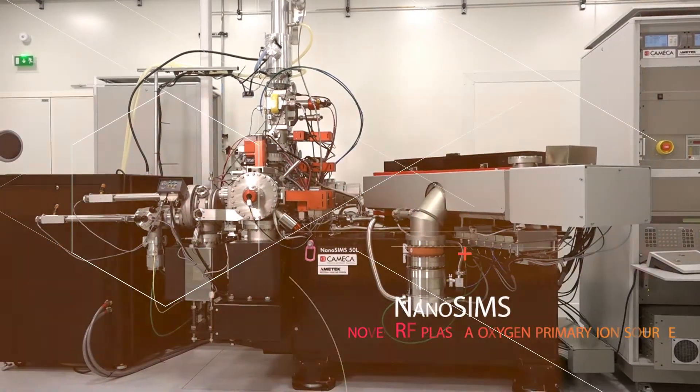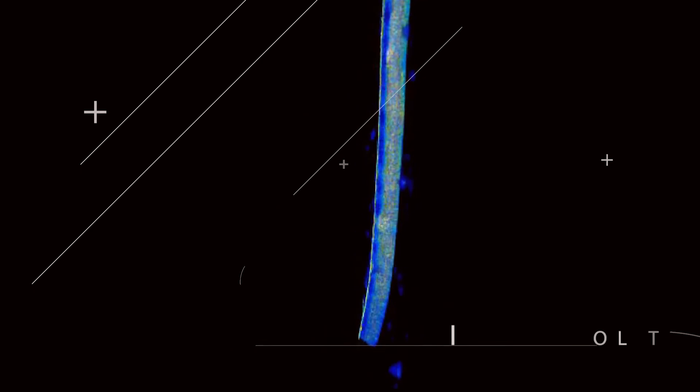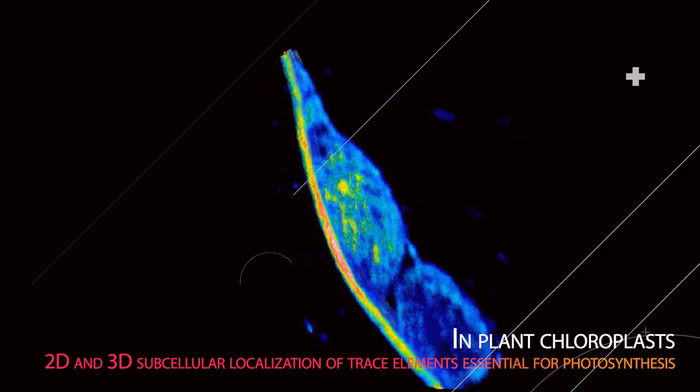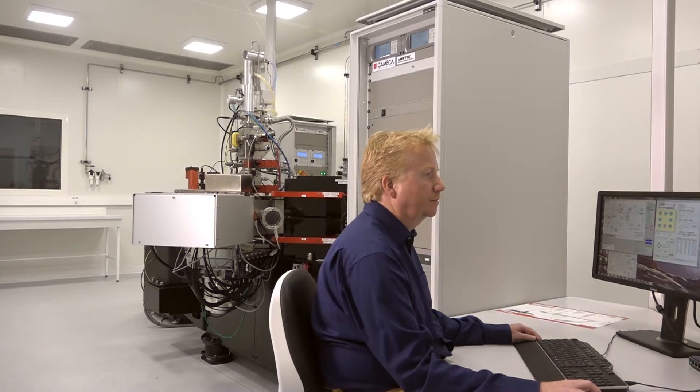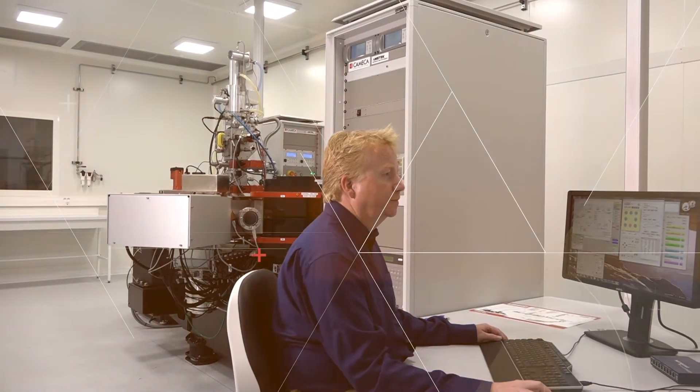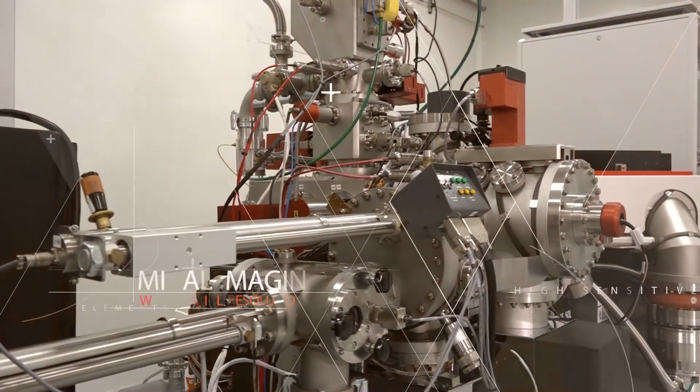Nanosecondary ion mass spectrometry, also called nanoSIMS, allows chemical imaging at a sample surface down to a resolution of 50 nanometers combined with high sensitivity. NanoSIMS can be regarded as a scanning ion microprobe or a chemical microscope.